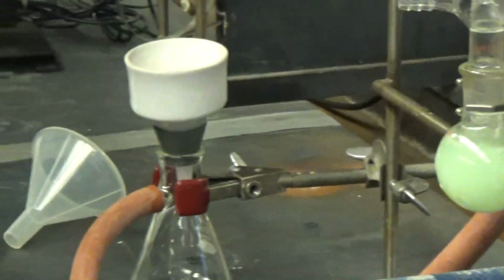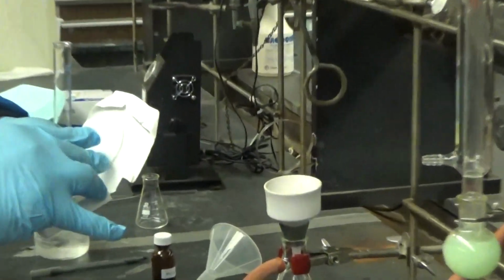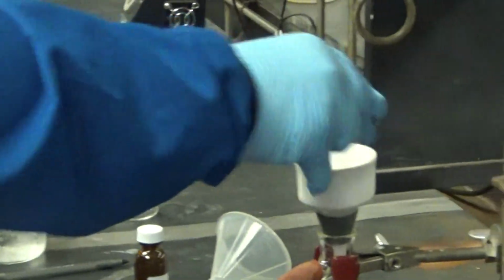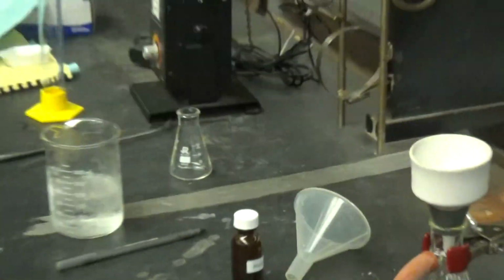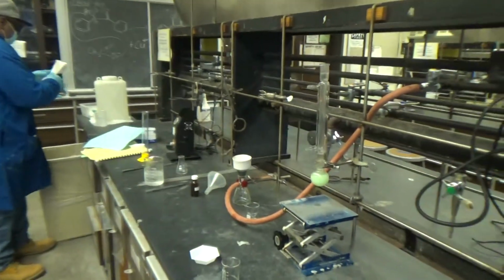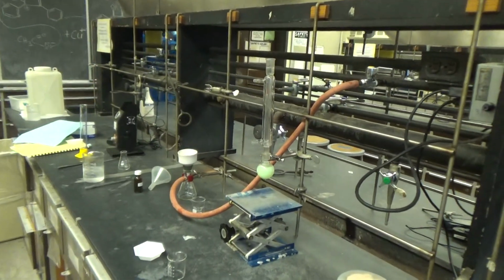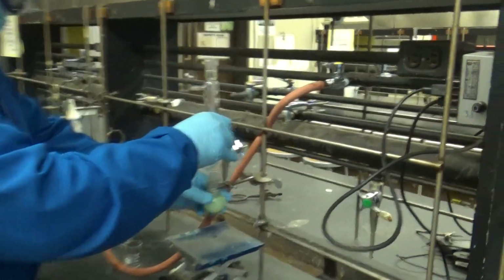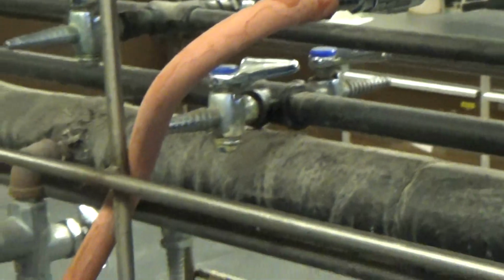What you do need now is a filter paper. I have some of them in my pockets. Alright, so we have a paper. I need to fix that. Alright, so we got the vacuum hose going.